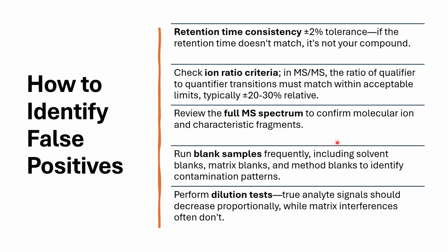Third one is review the full spectrum to confirm molecular ion and characteristic fragments. Fourth one, run blank samples frequently, including solvent blanks, matrix blank, and method blanks to identify contamination pattern.